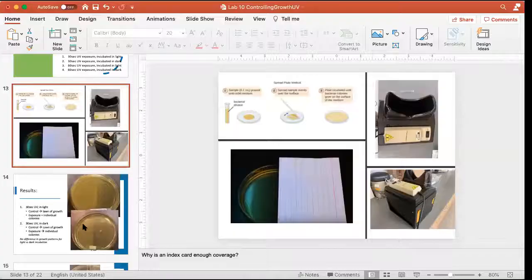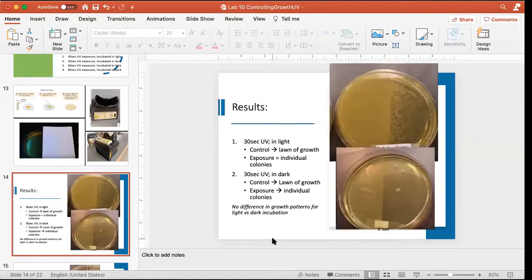All right. So here's an important thing that we noted, and we won't even need to mention again, and that's this. It didn't matter whether we grew the cells in the light or in the dark. We got the same results. Let me say that again. It didn't matter if the plates were in the light or in the dark. It didn't matter for either organism or for either time point. The plates looked almost identical, whether they were put into the light or the dark conditions.